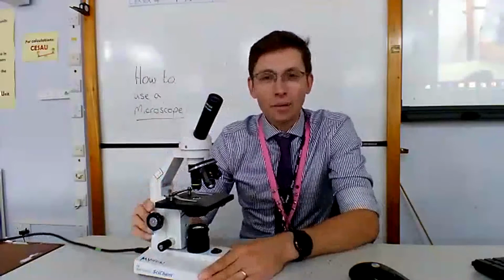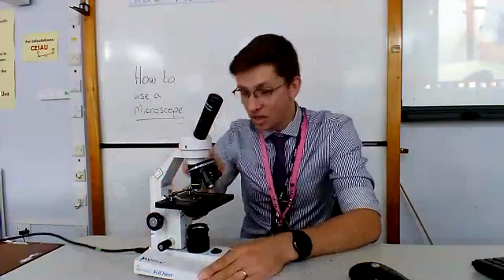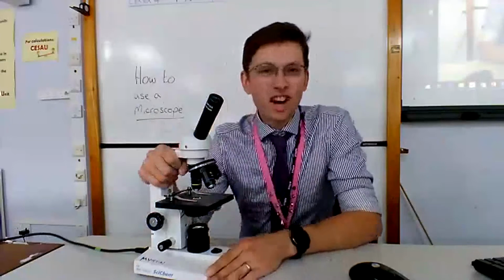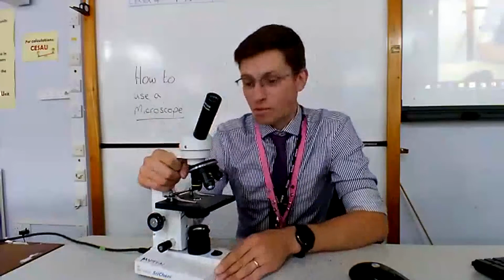Okay, hello everyone. Today we're going to look at how to use a microscope, and I'm going to show you parts of the microscope. I'm going to show you how to carry it safely, and I'm also going to show you how to look at a specimen on the stage. Okay, so to start with, let's talk about how to move with it.